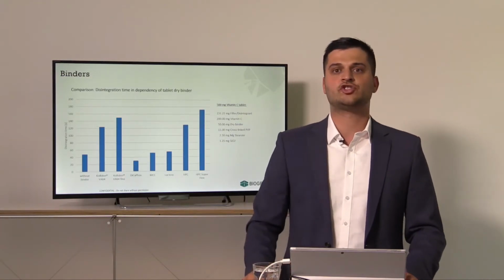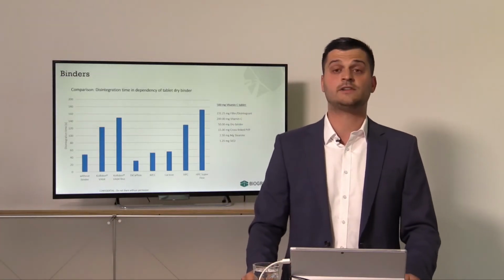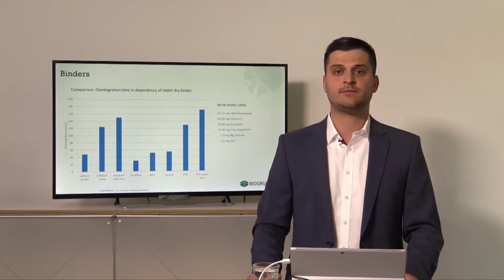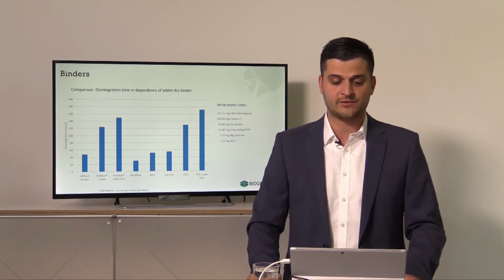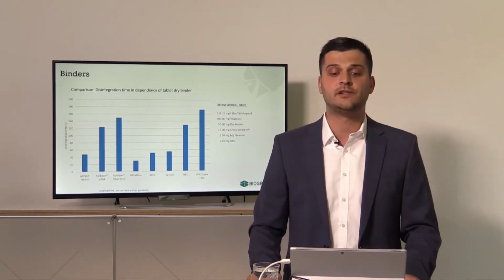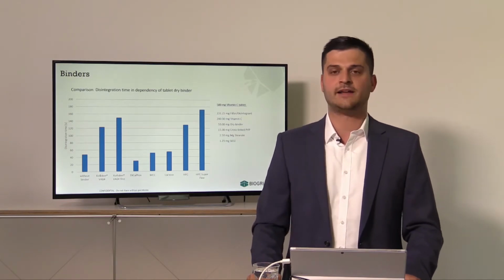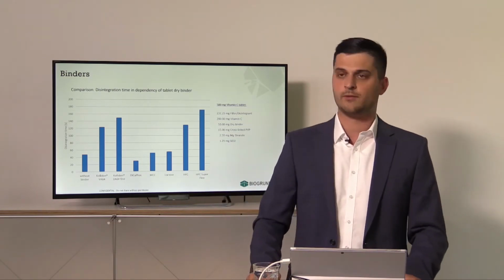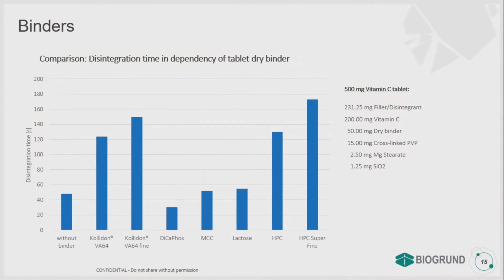This graph shows the impact of the binder on the disintegration time. It is essential that the tablet disintegrates within the prescribed time when we place it in a liquid medium. The superfine binder takes longest, but don't worry, this is all within the scope. We always have values below 180 seconds, which is totally fine.